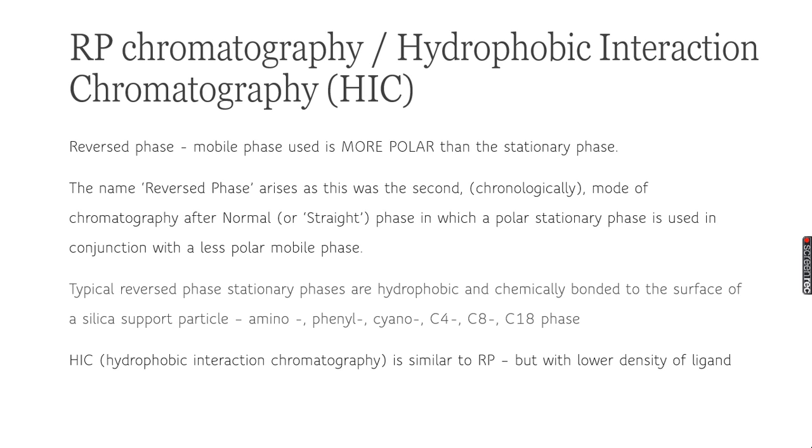In reverse phase chromatography, the degree of functional groups is too high, and if you have a globular protein, it will tend to denature. So reverse phase chromatography may not be useful for large molecules or macromolecular structures.